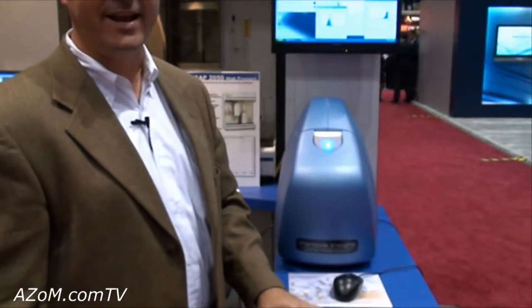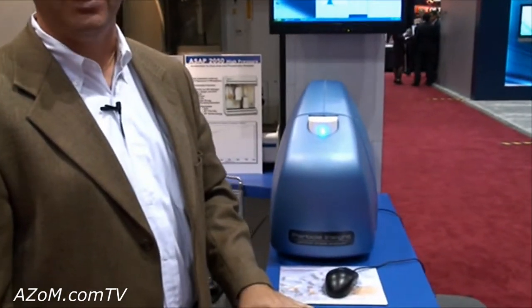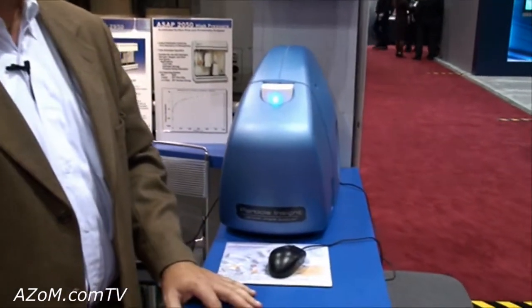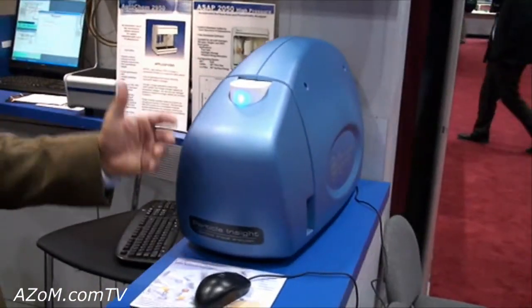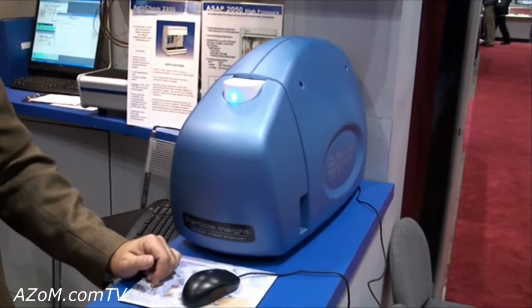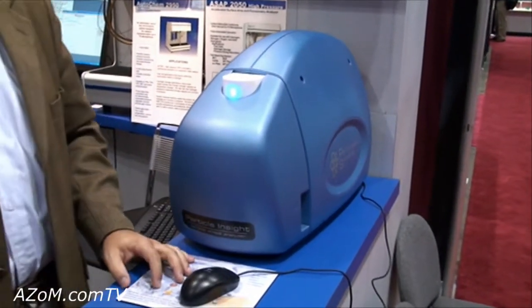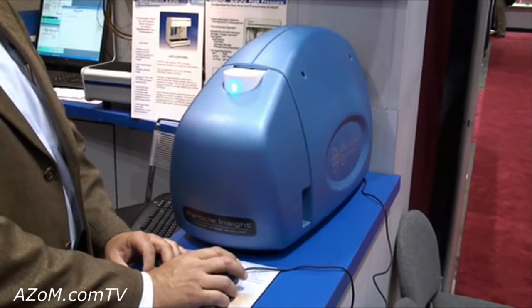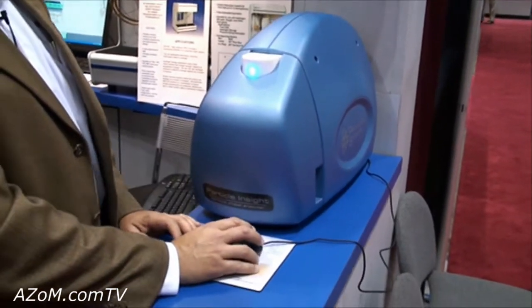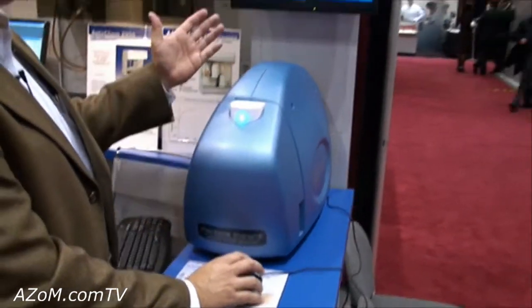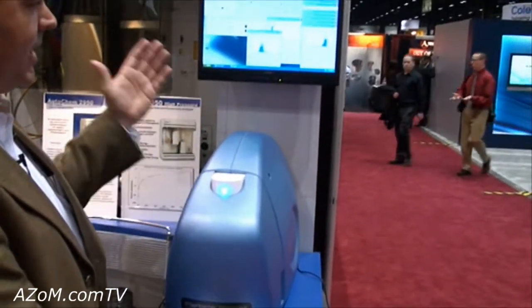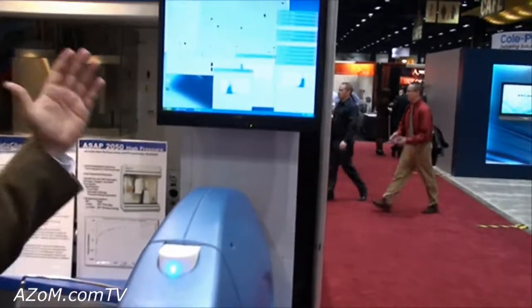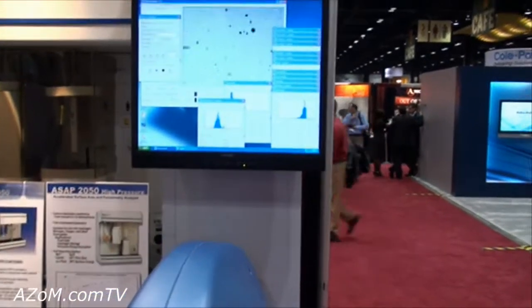Here we have the Micromeretics Particle Shape Analyzer. It's a dynamic image analyzer. A couple of very unique features: it's a recirculating system, so we make sure we get a good, representative population, and as you can see, it actually does flow-through image analysis.